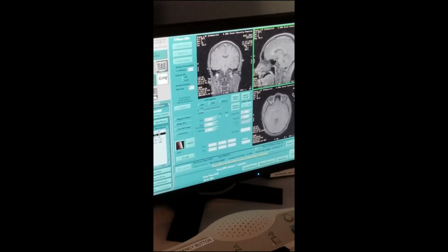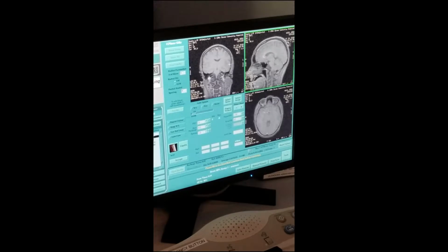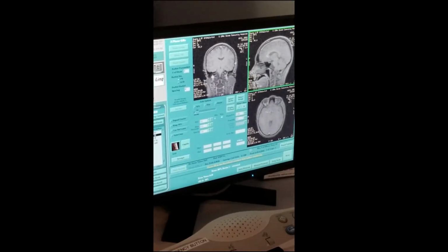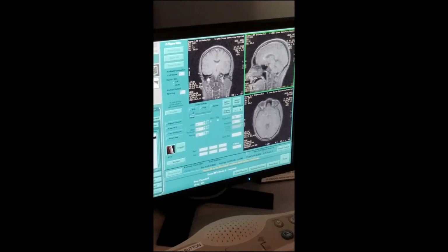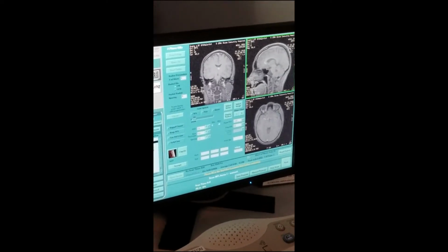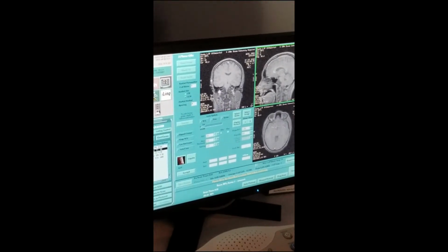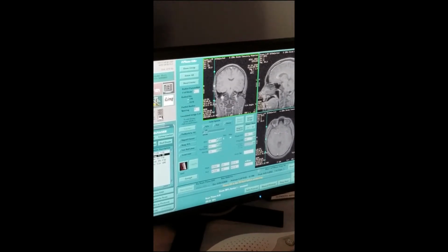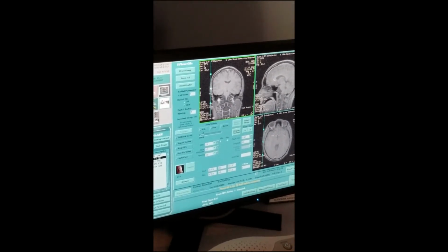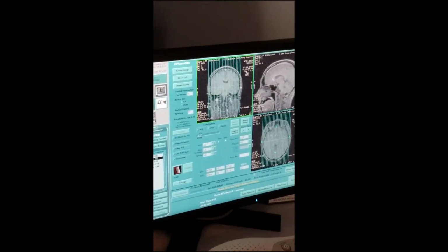Because we want to go from left to right or right to left, side to side, right? I think Tim likes to go right to left. His right or imaging right? Imaging right. Okay, so imaging right goes from your side to left side, yeah. So shift click. Okay, then you grab it and stop right there, right?